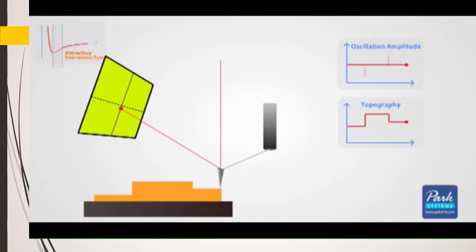Atomic force microscope, or AFM, is a powerful tool that enables you to see, explore, and obtain measurement data from your samples at the nanoscale.